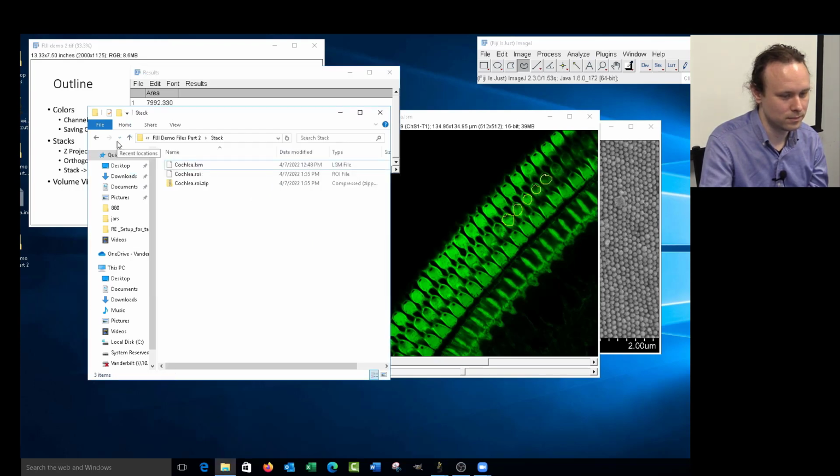Any other questions about the ROI manager or about the spatial information? Thanks, Bill. That's a question.